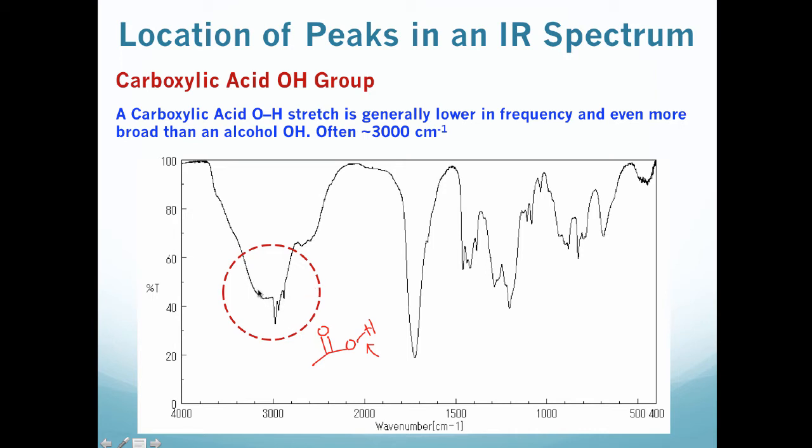You'll also see, in addition to our carboxylic acid stretch, we have some other stuff in here. And these peaks actually correspond to other bond stretches in the molecule. So these are actually carbon-hydrogen bonds that we'll see later. But they're just overlapping, so that's why they look like they're part of the same peak.